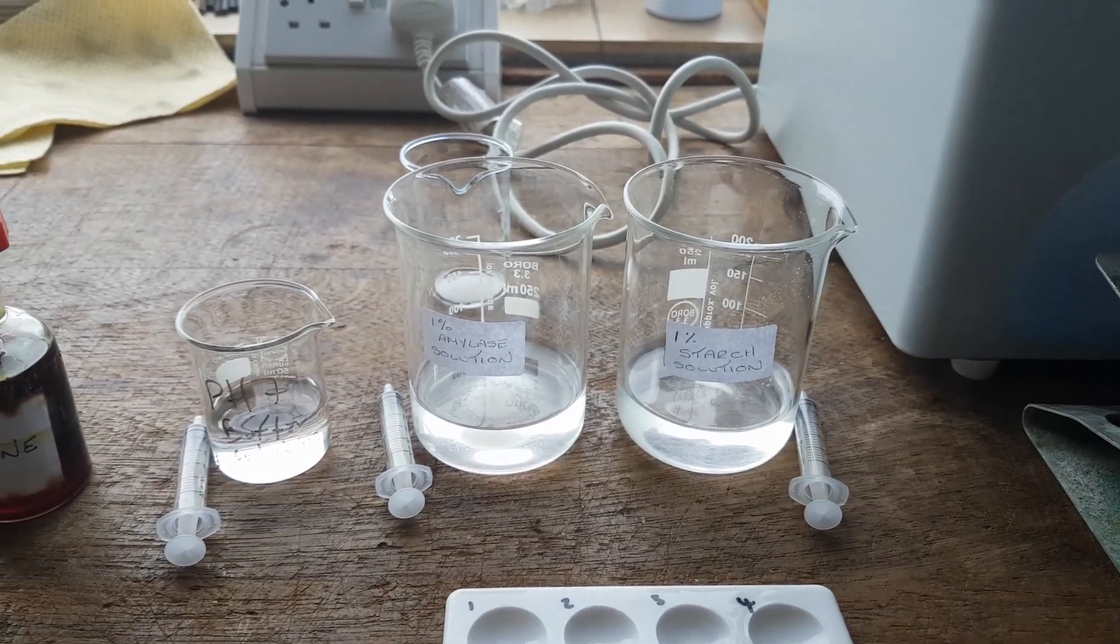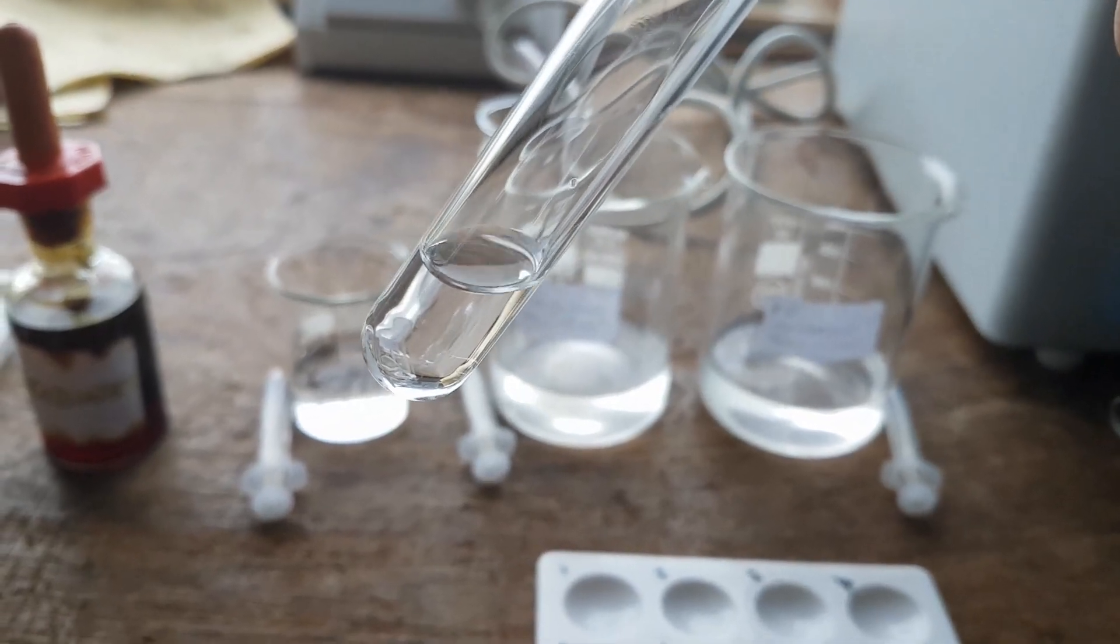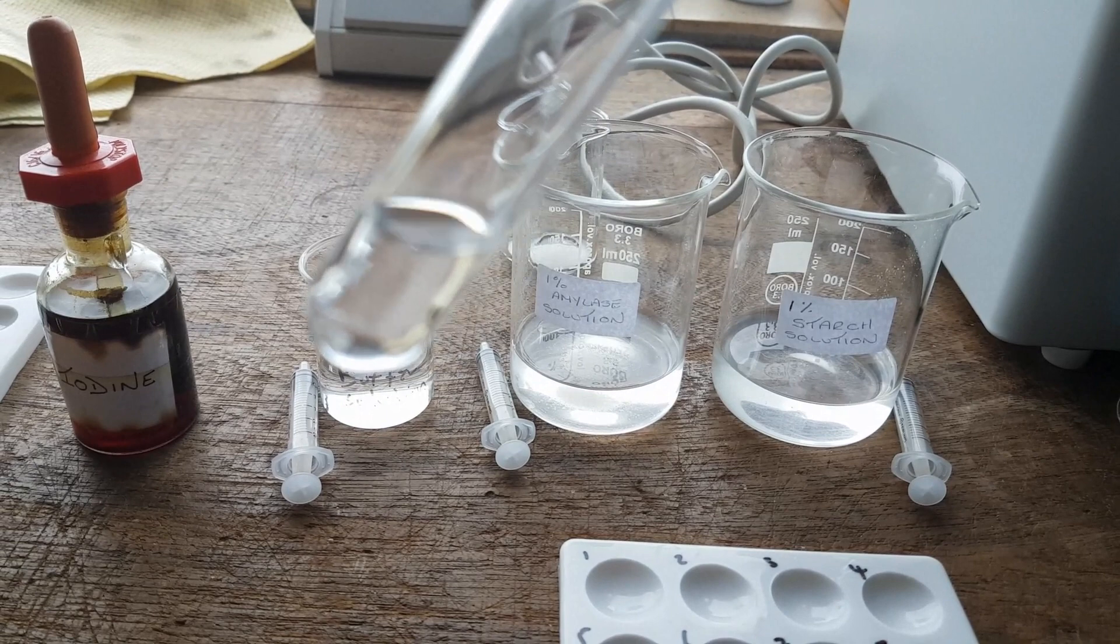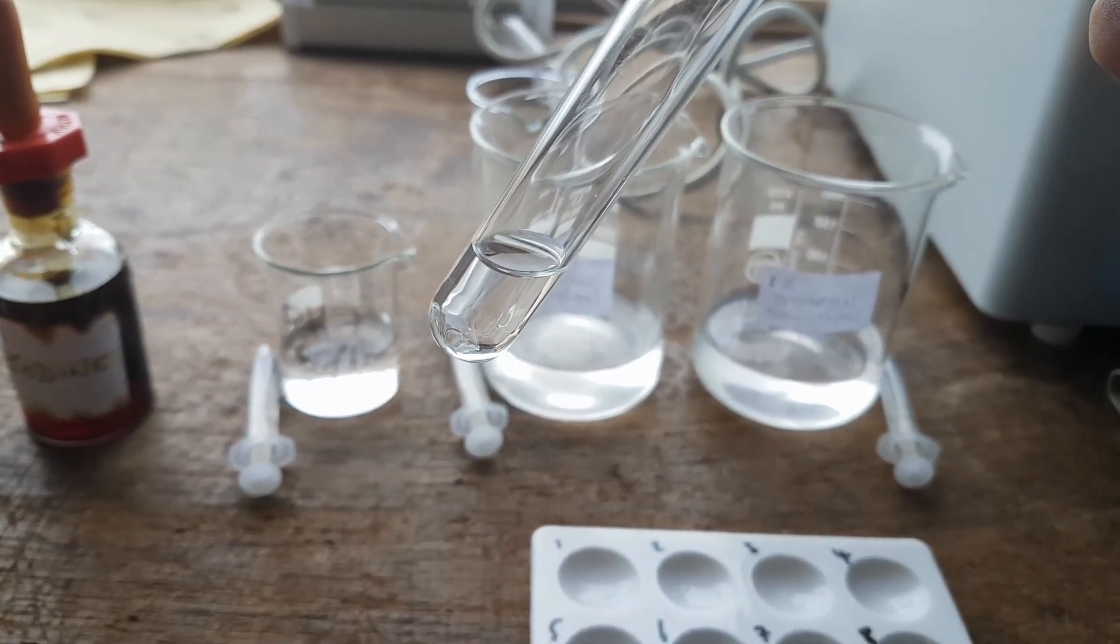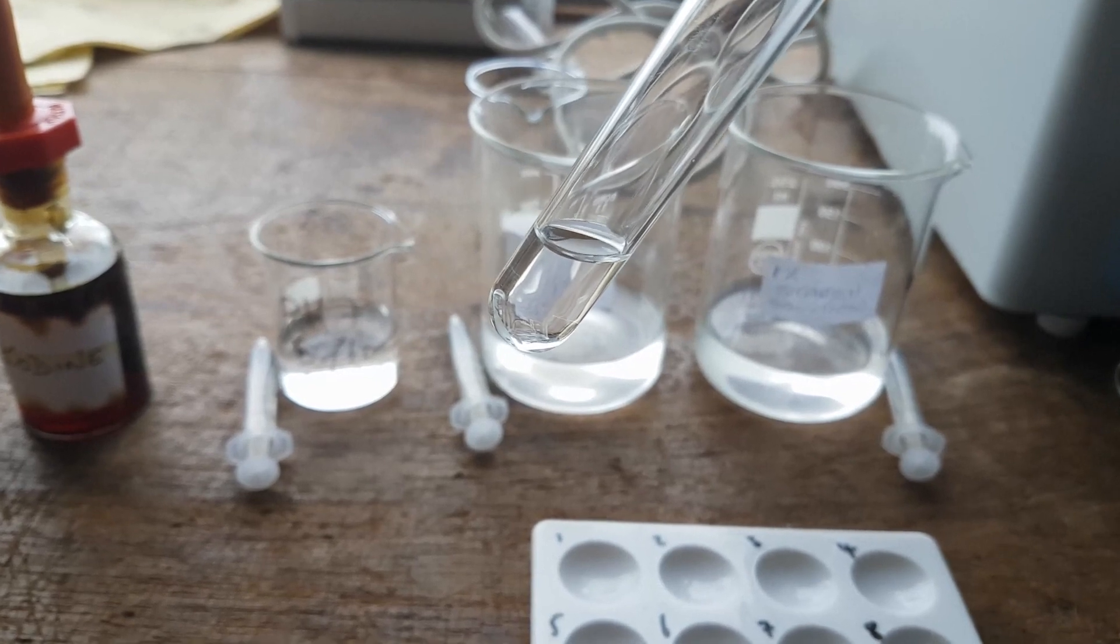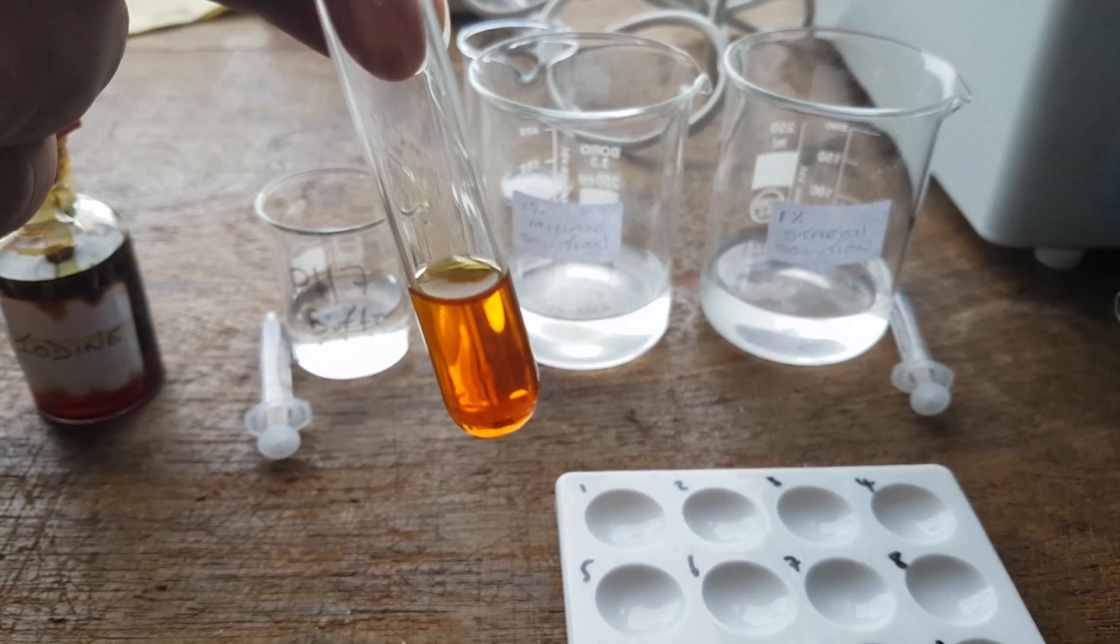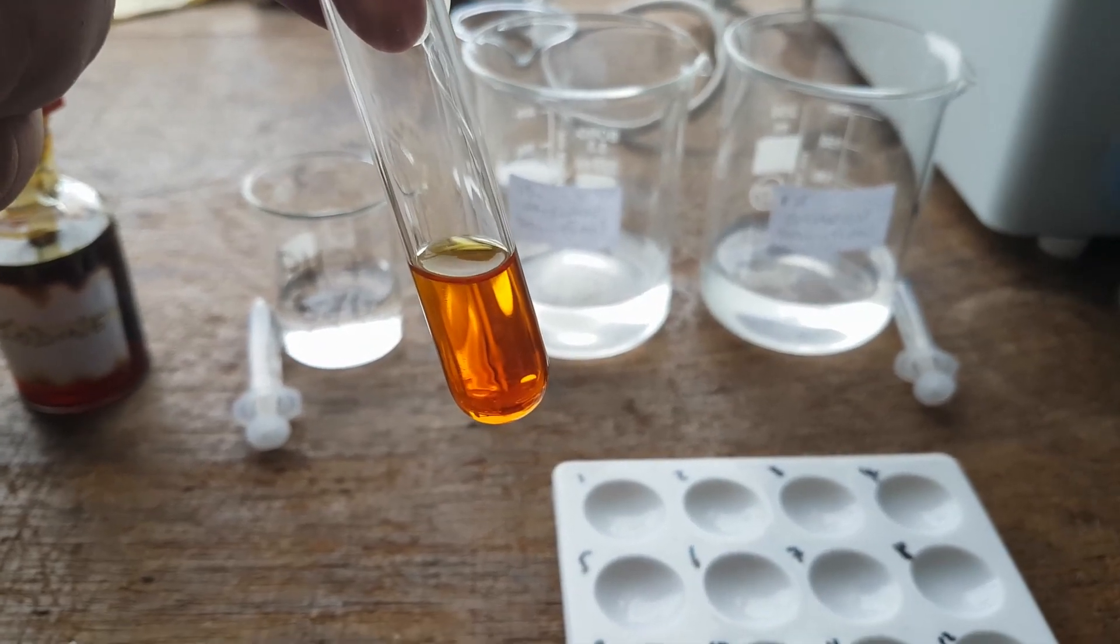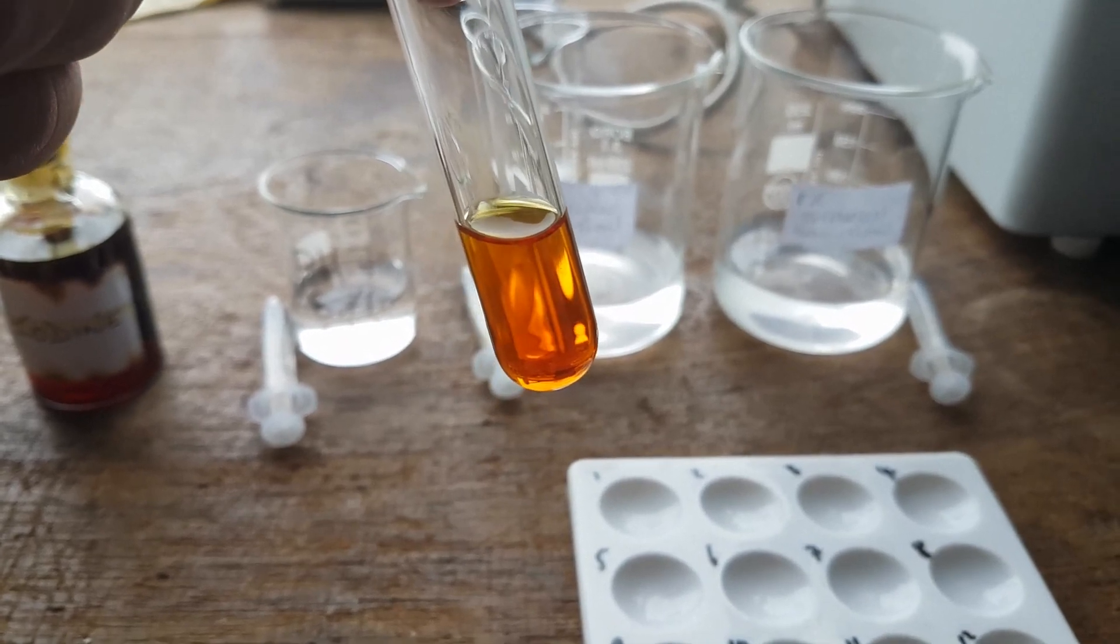Now as you can remember, a negative result, we fill up a test tube with water and then add our iodine to it. There should be no color change because of course, water does not contain starch. I'll show you that now. So I've just added the iodine in and the iodine is an orange-brown color. There's no change to iodine. This shows a negative result for starch.